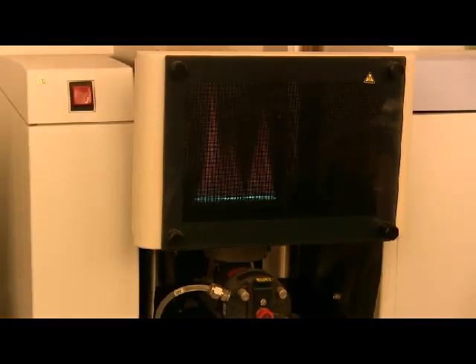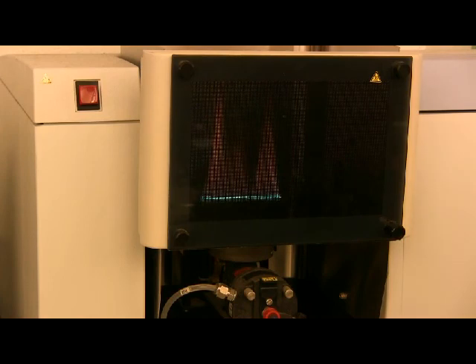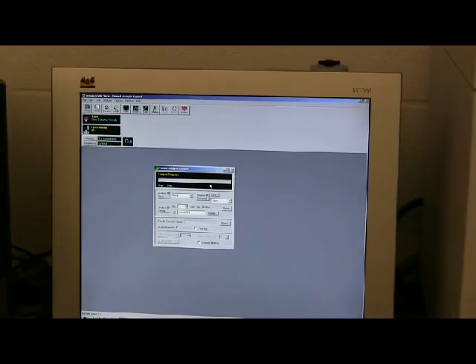Sometimes the flame won't go on. That could be because of the pressure. The cylinder might have no gas, or it could be below 50 psi, or 15 psi for acetylene. You need to just be careful. So close it. Then you click on manual. Okay. Now it's very easy.